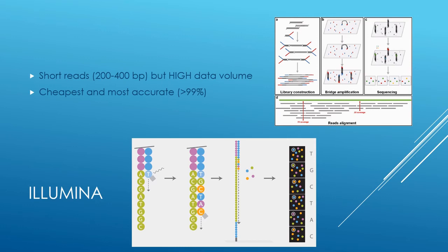So Illumina sequencing is performed on a flow cell plate where a lot of DNA strands are housed and sequenced at the same time. It starts with bookending the target DNA strands. This allows it to attach to the flow cell plate, and then bridge amplification occurs, where the DNA is amplified by using DNA polymerase on the flow cell plate.